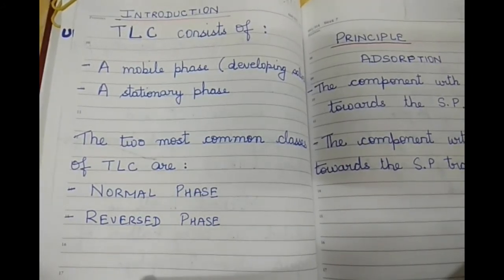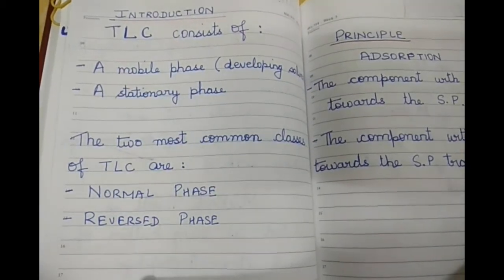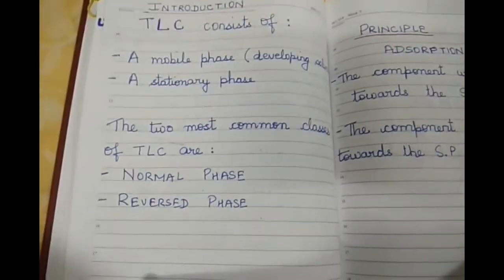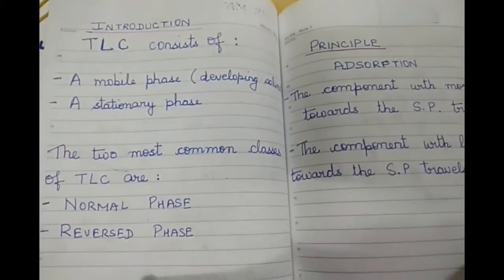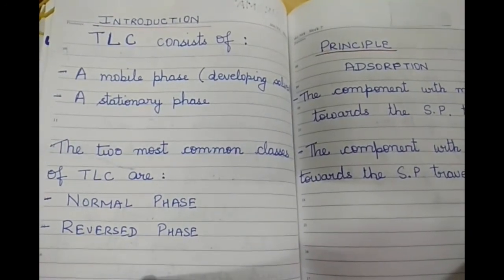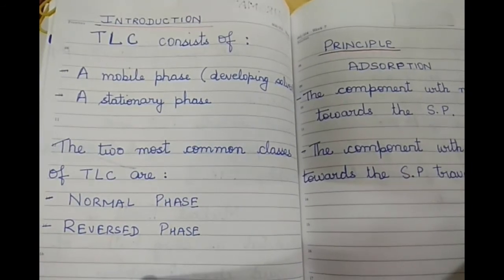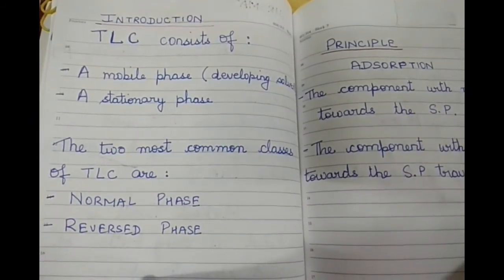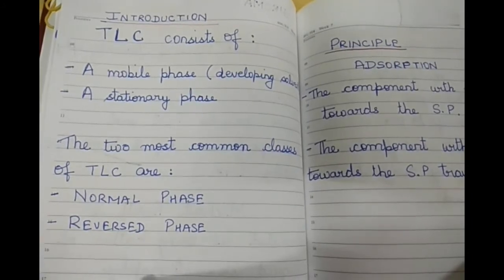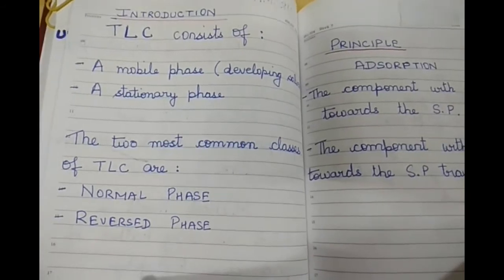The two most common classes of TLC are normal phase and second is reverse phase. Normal phase is the terminology used when the stationary phase is polar, for example, silica gel, and the mobile phase is an organic solvent or a mixture of organic solvents which is less polar than the stationary phase.